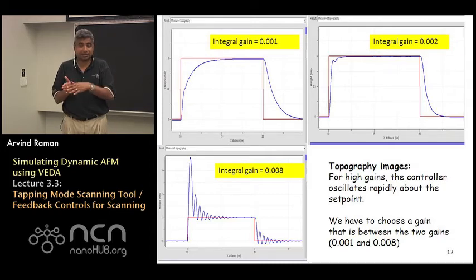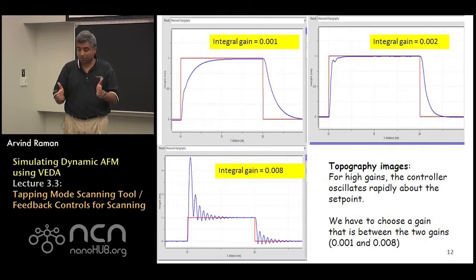The controller should have responded instantly but it doesn't. So near sharp features in AFM images there are always these transient regions which you should be careful about.